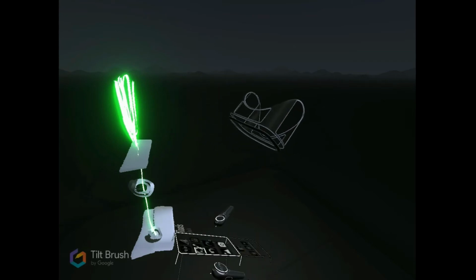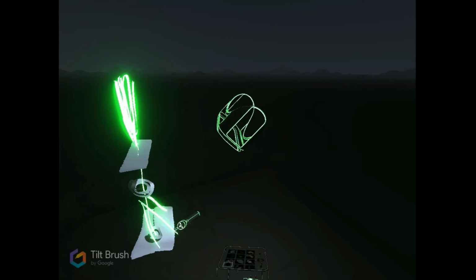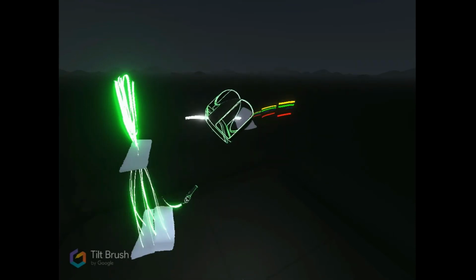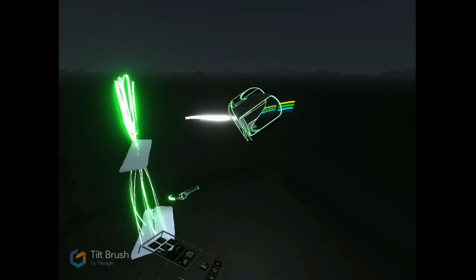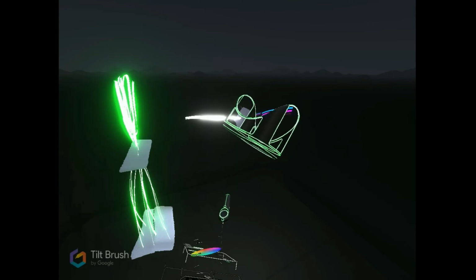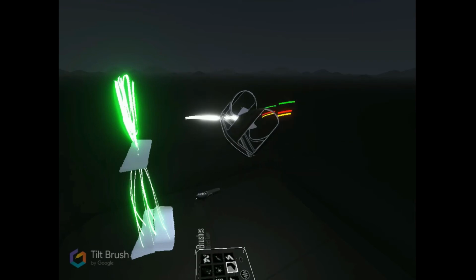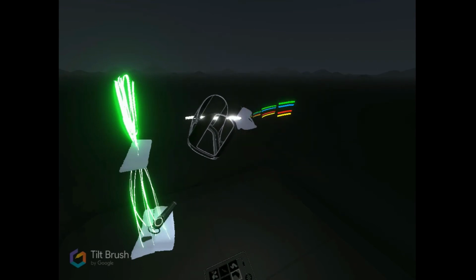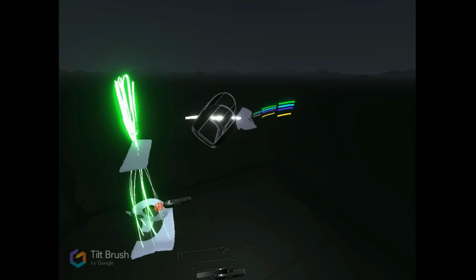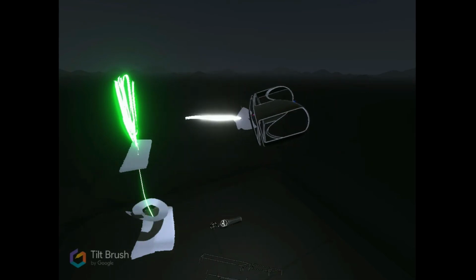And when you have just that one, normally you use the electromagnetic lenses and spread it out and make a big picture, like that, roughly. But in diffraction, you don't magnify anything. You just leave it as is and let all the spots occur. So actually, if you took an aperture and said, oh, I want just this spot right here, please, that would take away all of these other spots, and you're left with just that one.